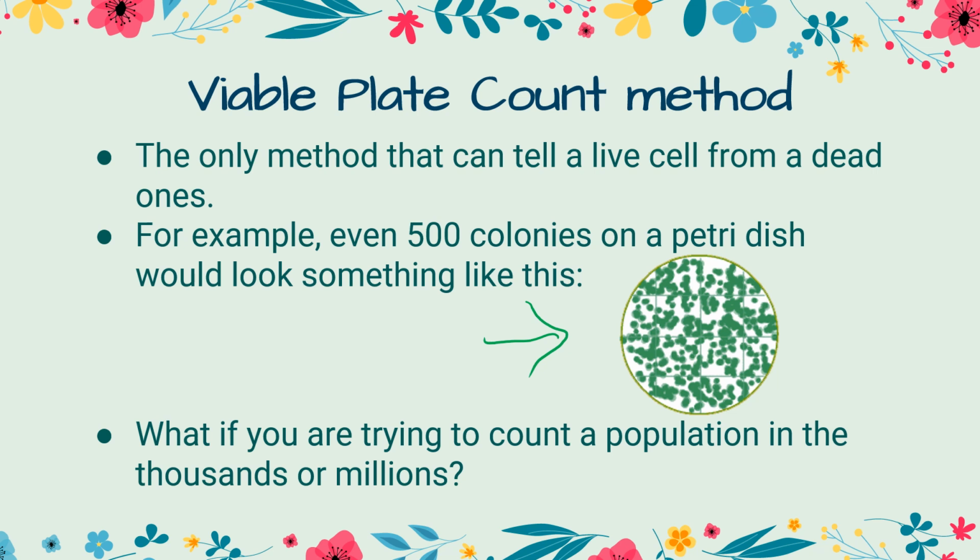You're not going to sit there and count every single blade of grass in your front yard. You don't want to sit there and count thousands or millions of bacteria. This is where dilutions come in and save the day. Not just dilutions, but serial dilutions, meaning dilutions over and over and over again to get a desired concentration.